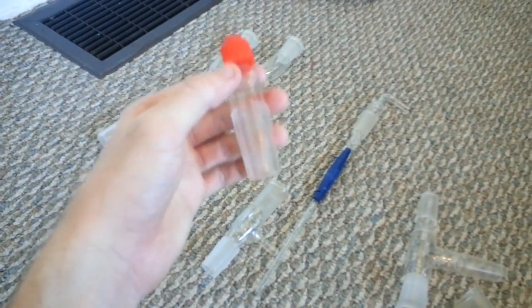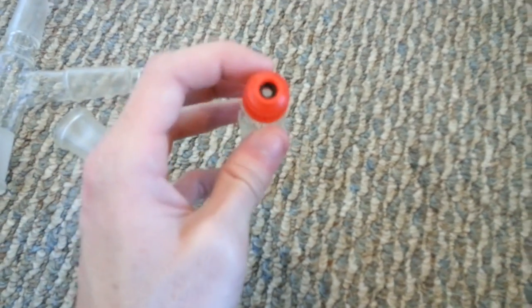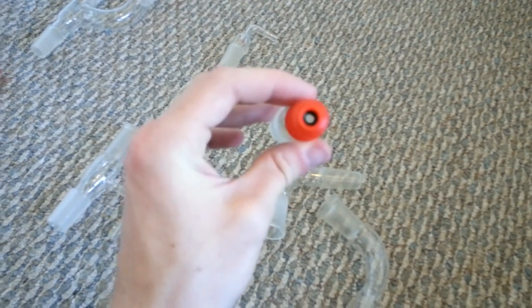These things are little adapters for thermometers. What you do is you put the thermometer in the hole at the top — it's got a little rubber seal on it, and the thermometer goes through into the round bottom flask or whatever piece of glassware you want, but it's sealed. So you can get a temperature reading and none of the gases will come out. It's also good for electrolysis: you can put the wires through here and the outside will be sealed away from the inside, but you can still get electricity in. I've got two of those — electrolysis plus and minus.